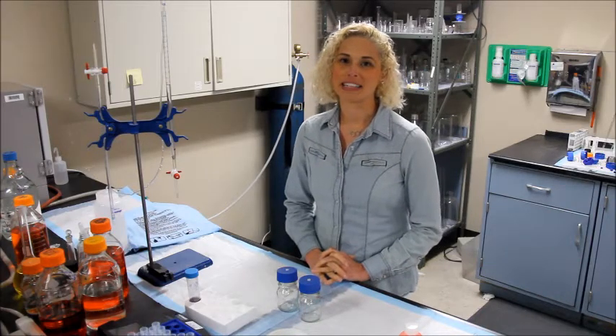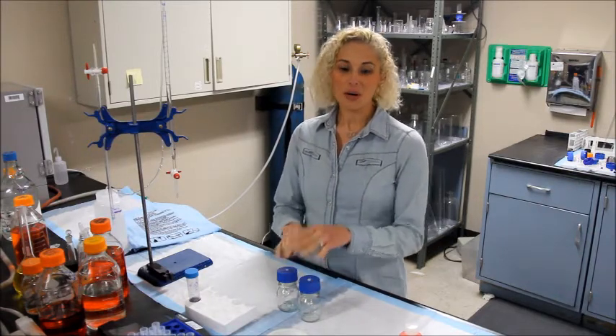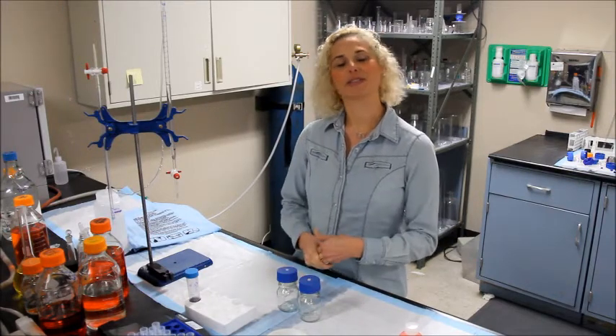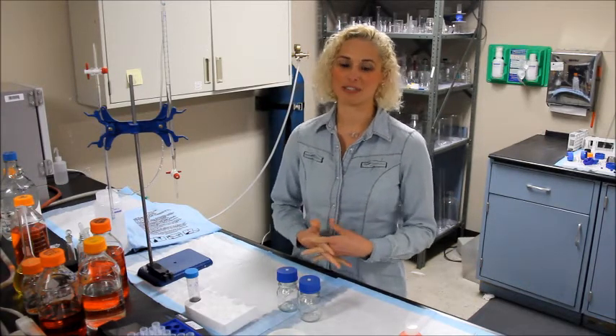Hi, I'm Rachel from Bometrica and I'm here to show you our new alcohol by volume test kit, which makes it possible for you to test alcohol by volume in your wine, beer, or any alcoholic beverage at home with accurate and precise results.